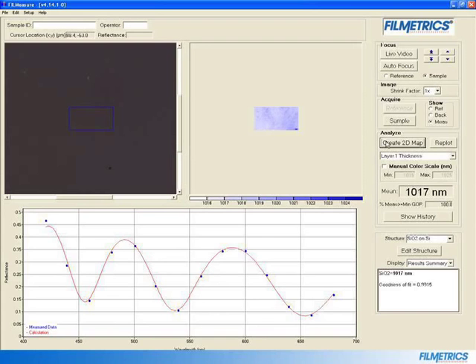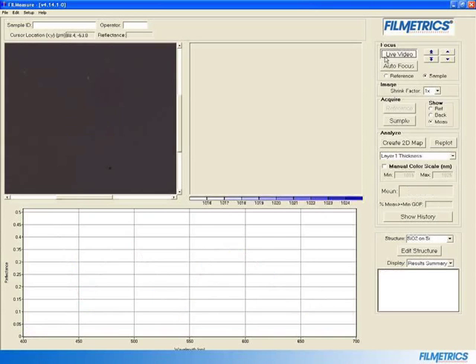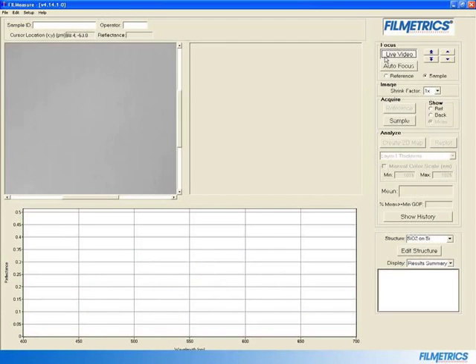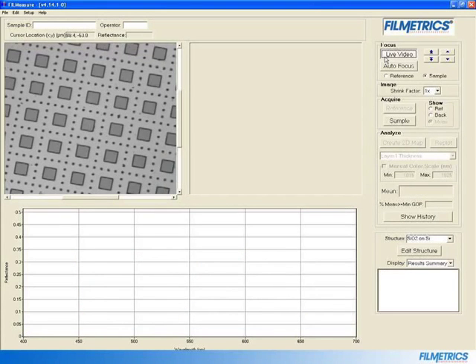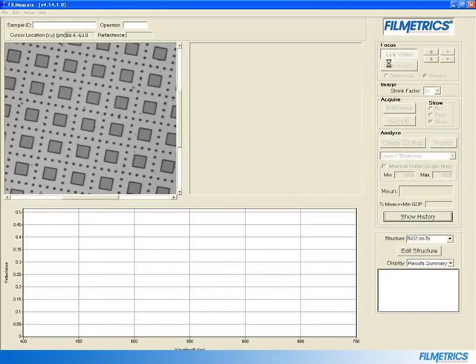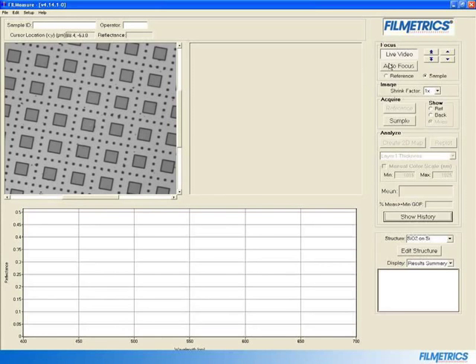You've now created a 2D thickness map. We can also image the focus part of the wafer where the SiO2 layer is patterned. Click on Live Video, move the wafer to the focus section and refocus the system. Then click Sample.